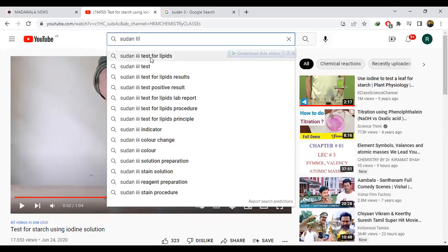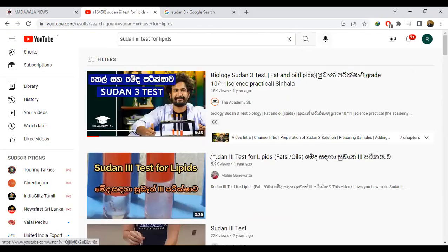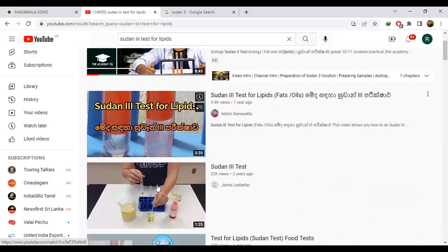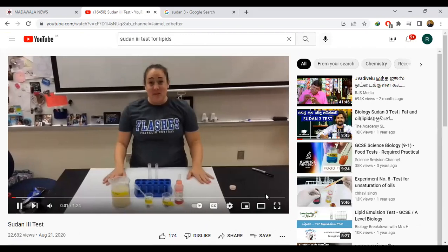Sudan 3 test for lipids. This is a Sinhalese one. Okay, too long. I don't like lengthy videos because we don't need to spend too much time.